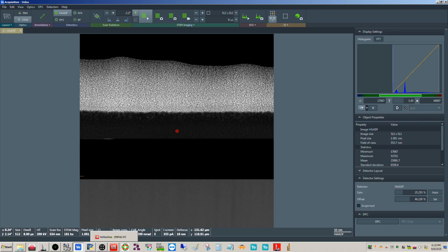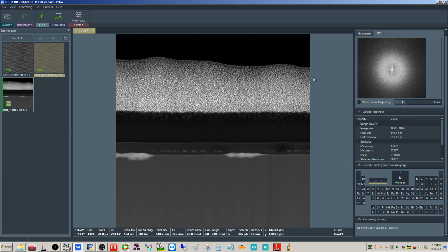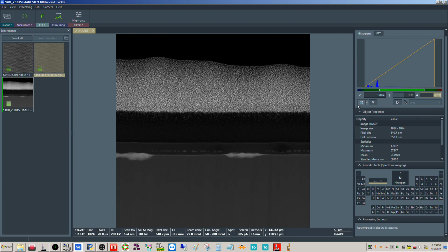Okay, let me blank the beam so we're not pasting it. Okay, so same thing here. Click on histogram. You can look at the maximum and the minimum. And you can see the minimum is basically what we're seeing here based on auto levels. And again, you can just type in the max, which is 57,250 basically. And if you do that, it automatically turns off auto levels, okay? So now you're removing any of the clipping, okay?